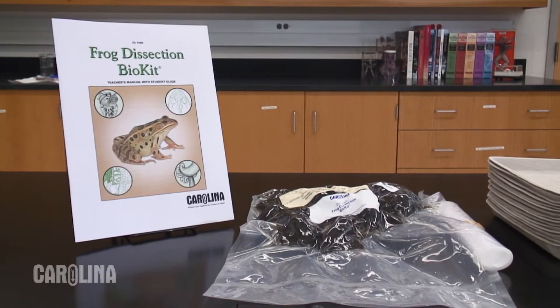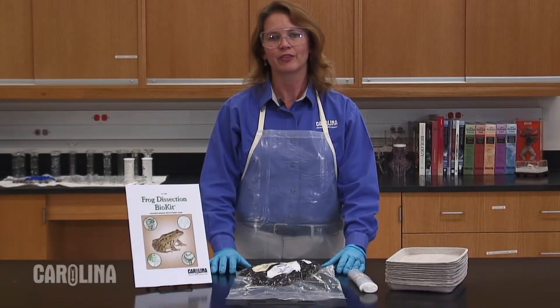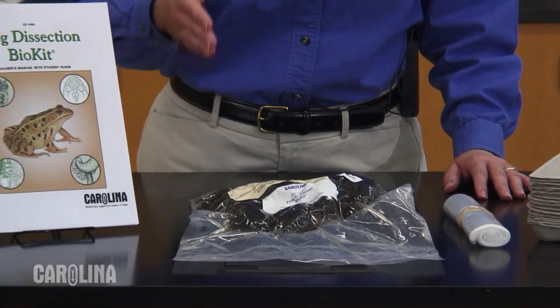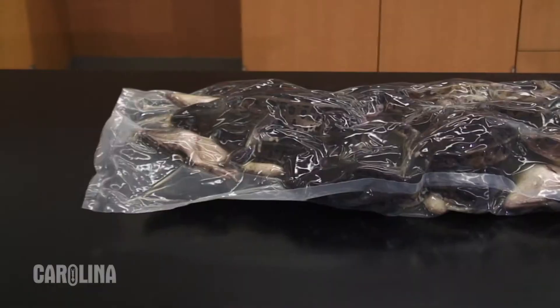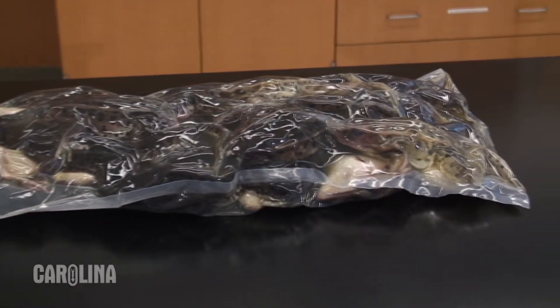Our kits are a great option to consider because they have everything you'll need to teach your dissection lesson. We've got the frog dissection bio kit that includes enough frogs for a class of 30, plus a teacher's manual with student guide. We also offer quantity discounts when you purchase 10 or more frogs, as well as 100 or more.